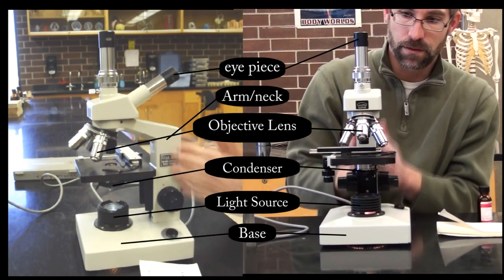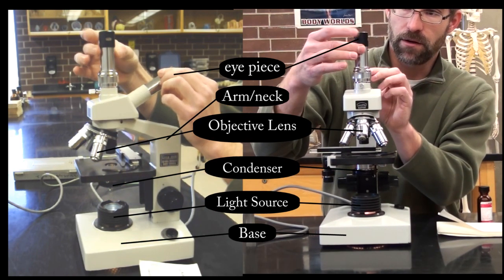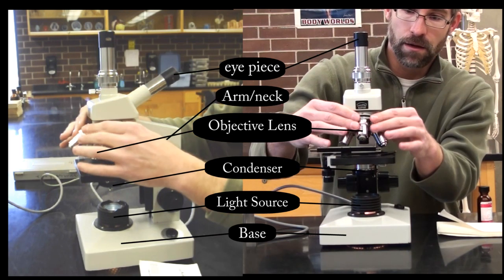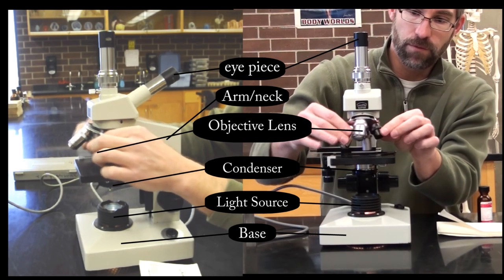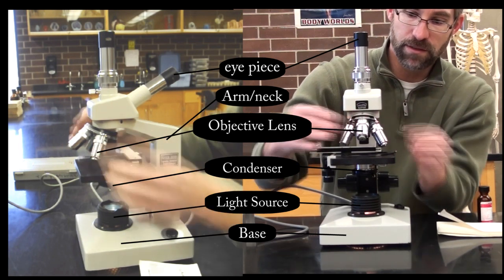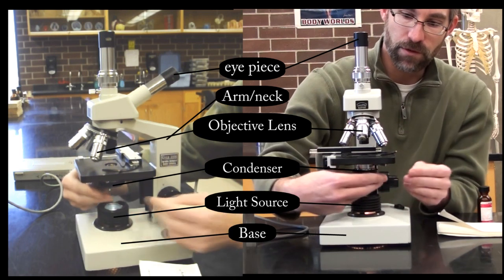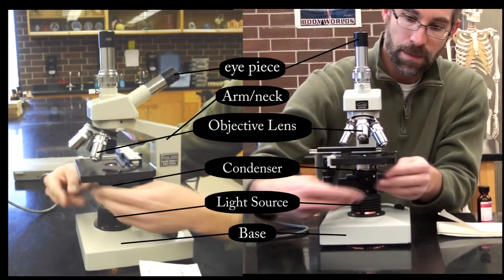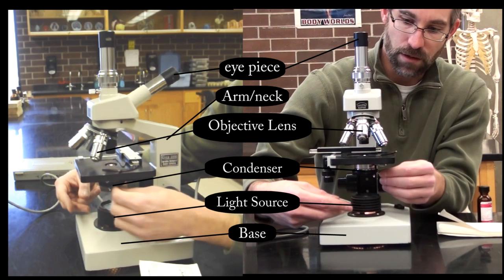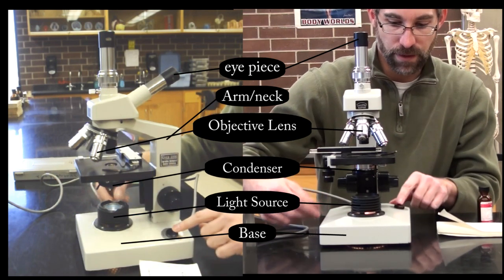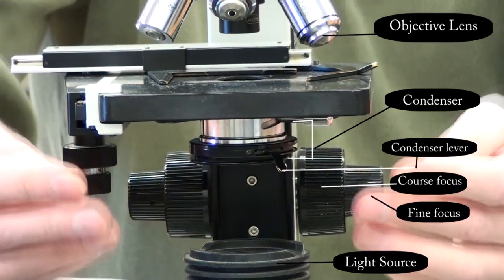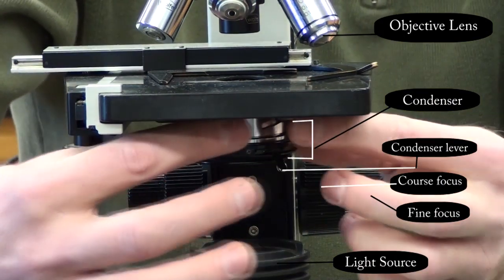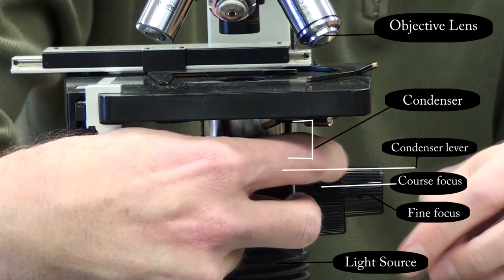So we've got the base, arm, headpiece with our objectives and eyepieces. We've got four different objective lenses. The condenser and iris will allow us to control light, along with our light source and switch. We have coarse focus, fine focus, the condenser unit, and the iris.